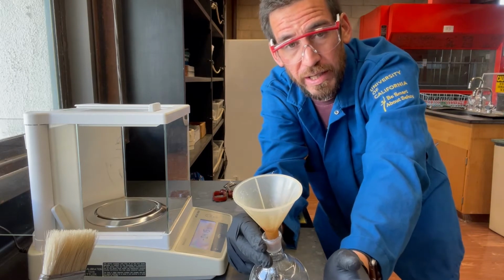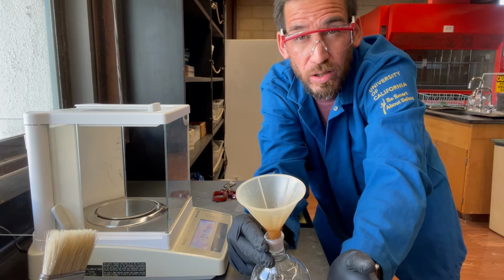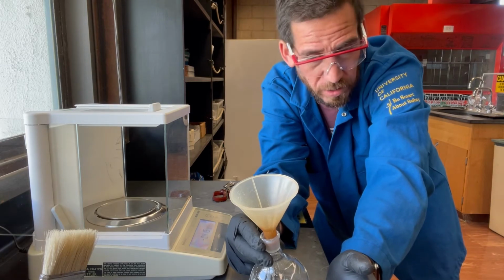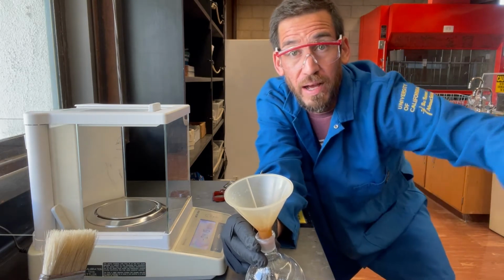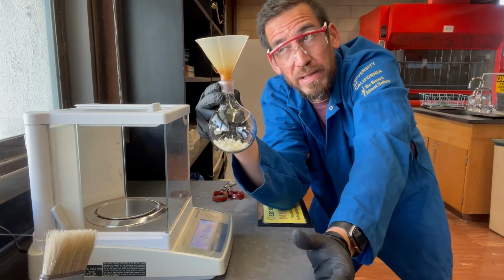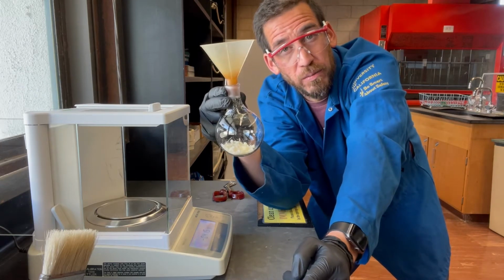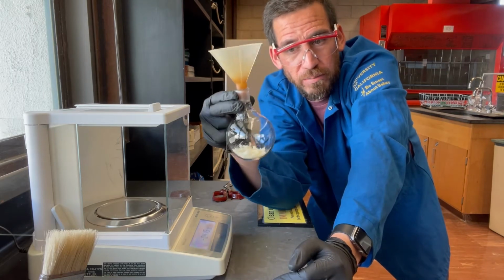You need to make sure that you're following the instructions, because if you destroy your compound, then you gotta start over, right? But a way to avoid that is to save a little bit of this stuff on the side just in case you mess up, right? So if you did mess up on this and you did get a yield, maybe not one that's sufficient enough to move on to the next step, you can do the reaction again with the stuff that's left over, just on a smaller scale. But ideally, this 5 grams should work.